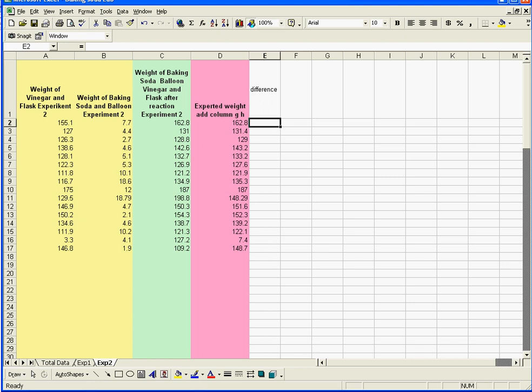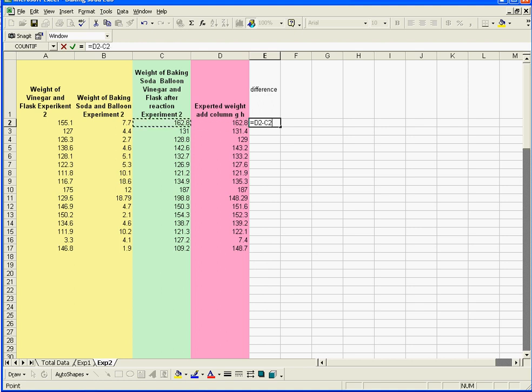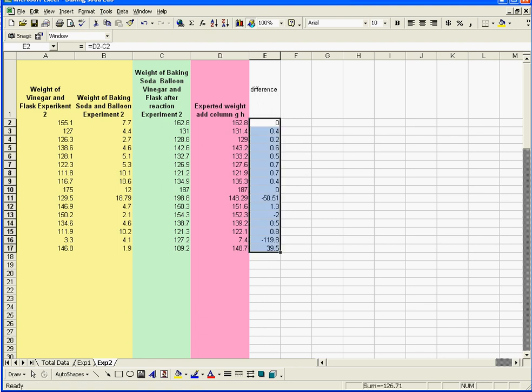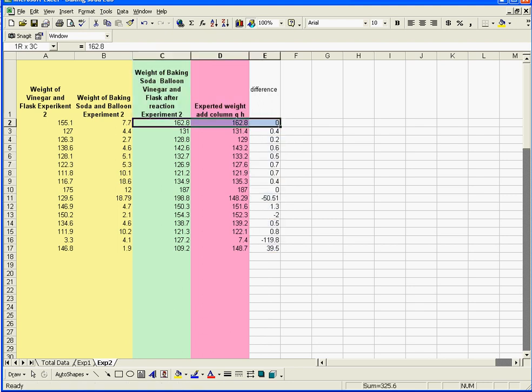Now all we need to do is, what's the difference? The difference is going to be equals, what you would have had if you added the two together, minus the actual weight that you weighed on the scale. I'm going to go enter. And that first one, this person redeemed himself, because that was actually perfect. There actually was no difference. They caught all the stuff that was coming off.